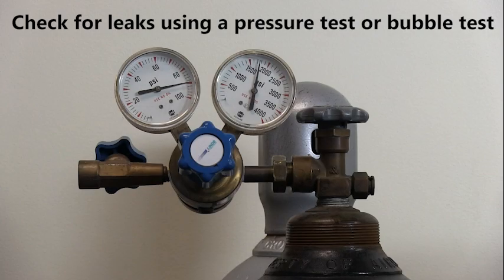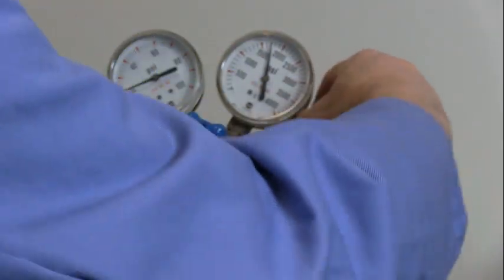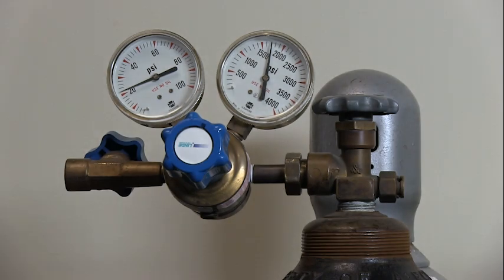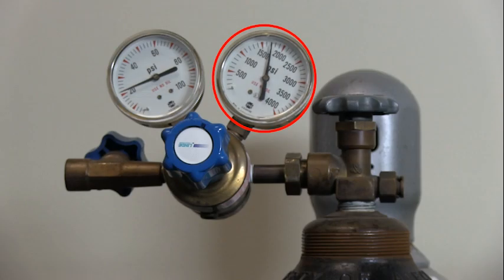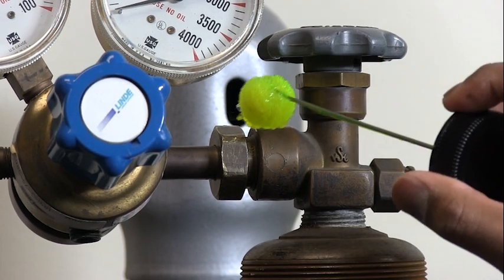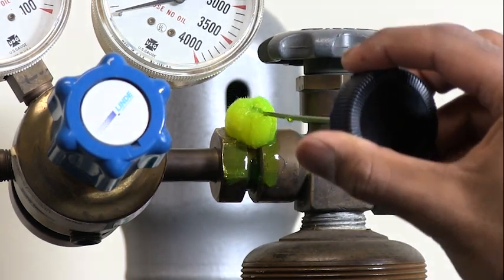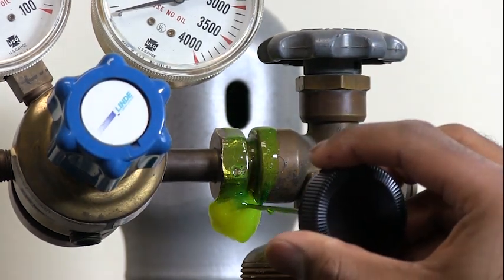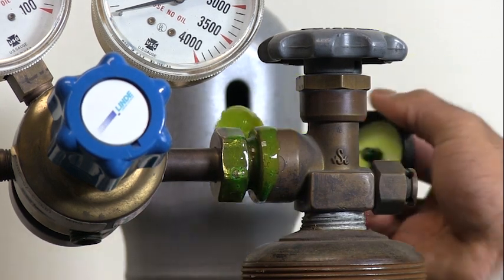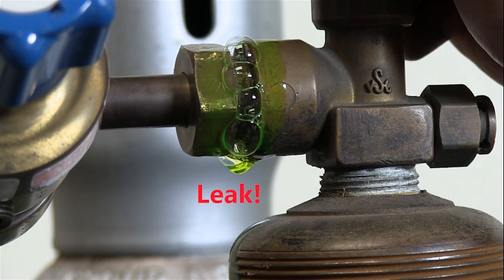Leaks can be detected by performing a pressure test or a bubble test. To perform a pressure test, close the cylinder valve after checking the regulator's function. If the pressure on the inlet gauge remains steady, there are no leaks. To perform a bubble test, use an approved bubble solution such as Snoop. Apply the solution near the inlet connection, the outlet connection, and the valve stem connection. If there are no bubbles, there are no leaks.